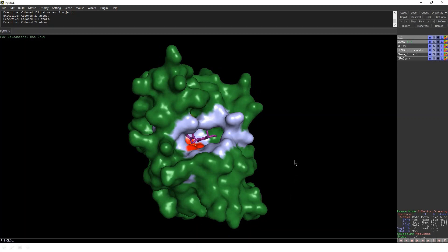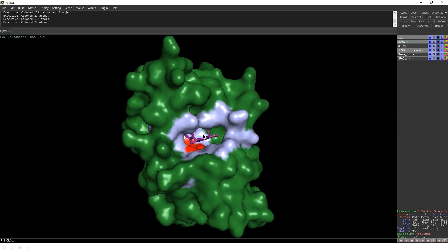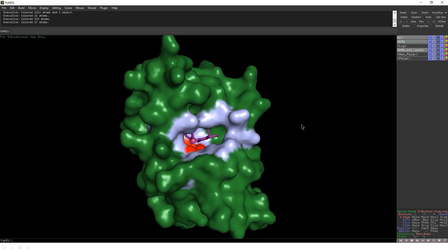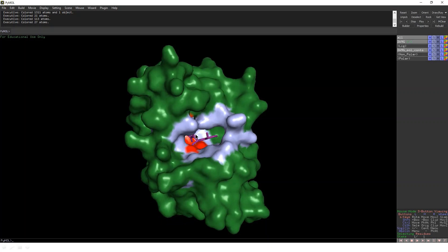At the end of this video, you will be able to analyze the interactions of the ligand and the protein in a similar format, and you will be able to differentiate the polar and non-polar interactions using color coding. Here, I have coded the polar interactions with red color, while the non-polar interactions are coded with light blue. The entire protein is colored as forest green. I will give you a step-by-step procedure of how to attain this kind of analysis.